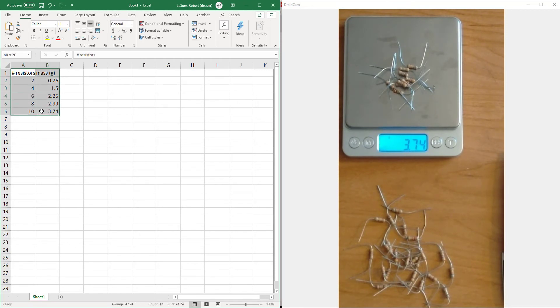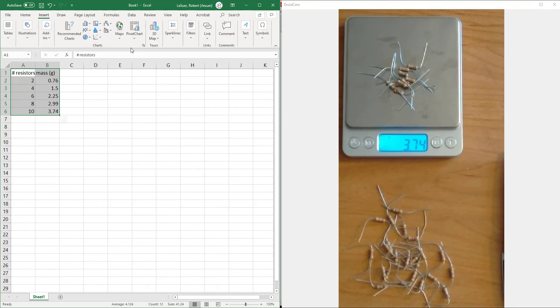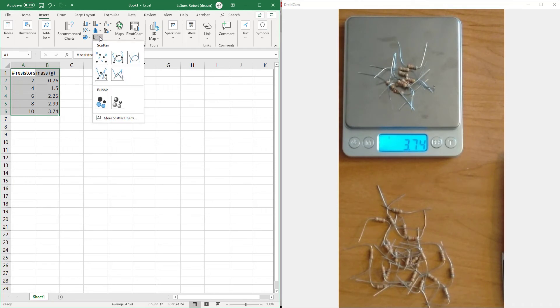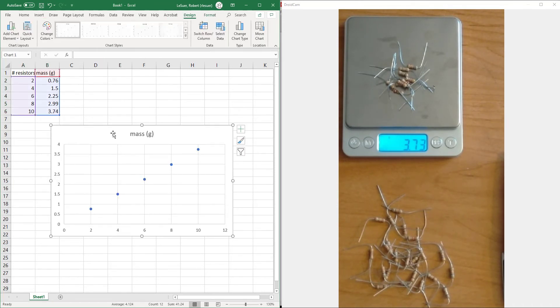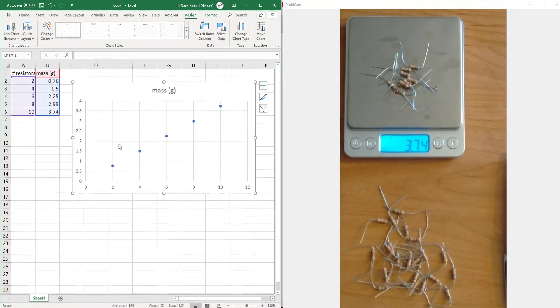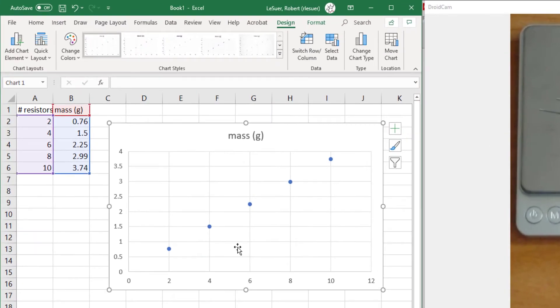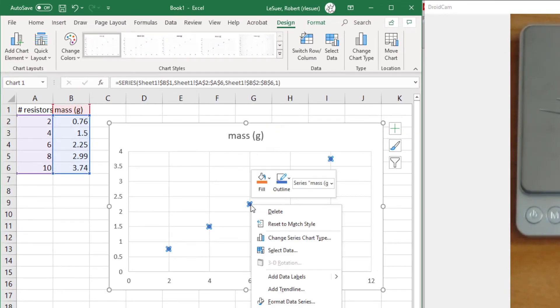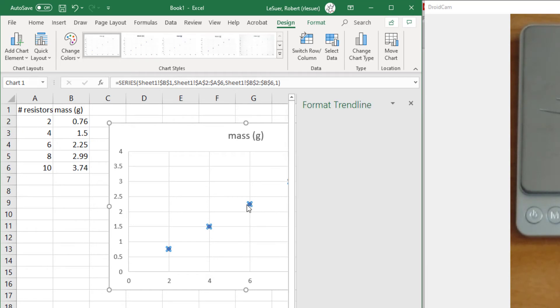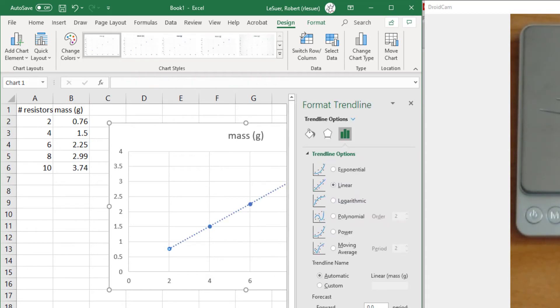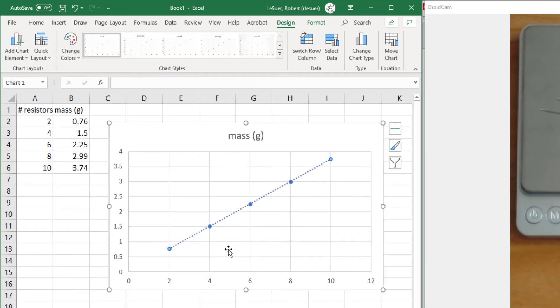If we create a plot, we're going to choose an XY scatter plot not connecting the points. We see that looks like a fairly straight line. Let's go ahead and add a trend line. And sure enough, it is straight.